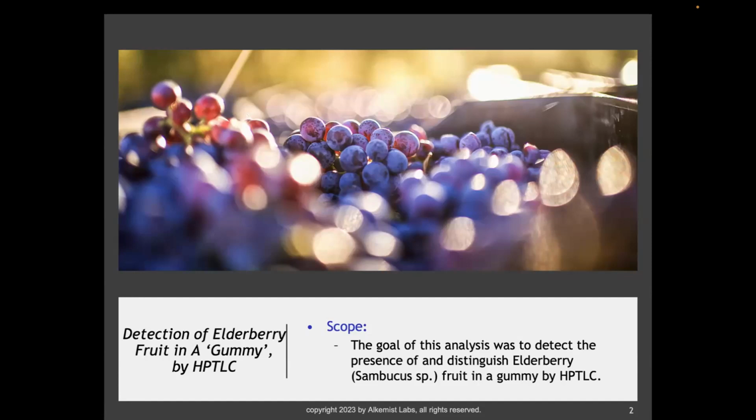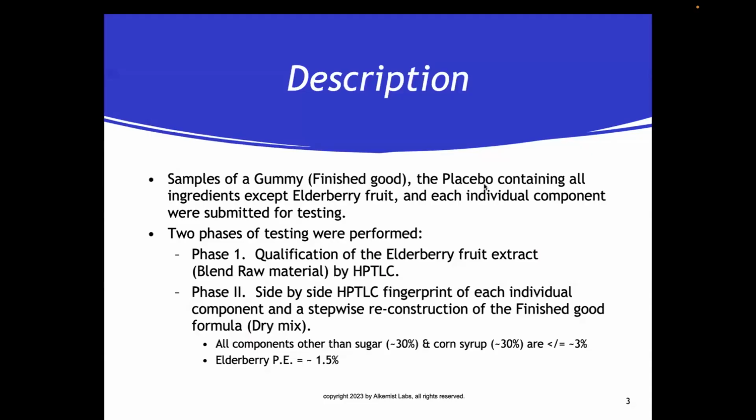So the goal of the analysis was to detect the presence and distinguish elderberry Sambucus species in a gummy by HPTLC.